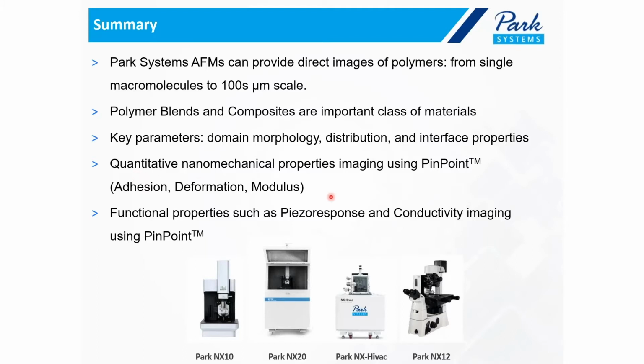We can acquire quantitative nanomechanical data using pinpoint imaging, for example, adhesion, deformation, modulus, stiffness. This is obviously not an exhaustive list. And finally, I demonstrated to you the functional properties mapping, such as piezo response. I showed you an example and demonstrated conductivity imaging using pinpoint.